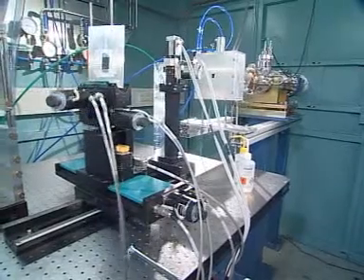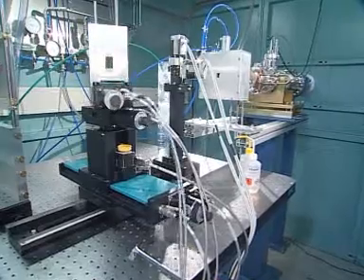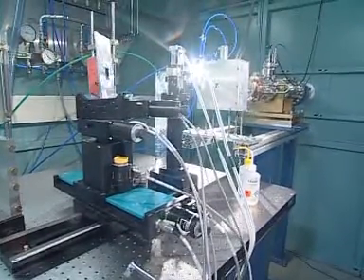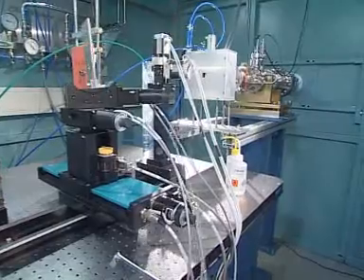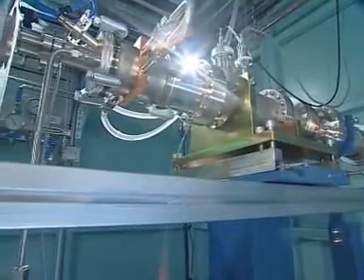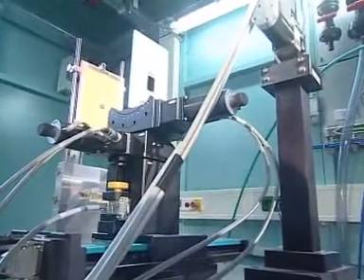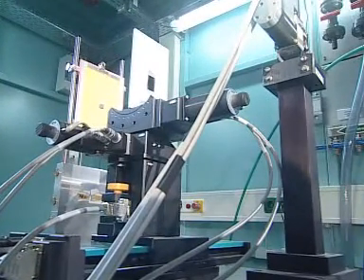The topographic measuring station is an installation for use whenever the structural properties and the quality of crystals are to be determined in fundamental research, to improve materials in crystal growing, and in the investigation of thin epitaxial layers or solid-state devices.